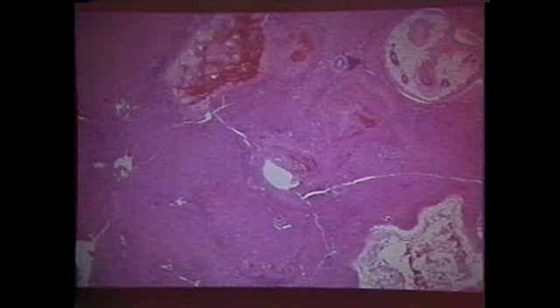This is to get rid of waste. Here we go. Here's vitellaria on the periphery. And here, this is what they look like. It's not a hard diagnosis to make. But if you have this thing migrating in a sheep, you'd probably know what it is. You'd play the vet game and say it's so-and-so.